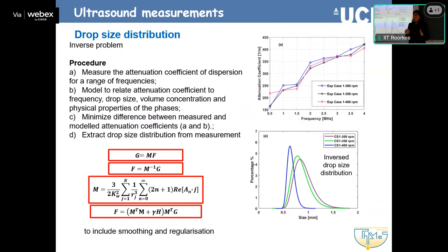With all techniques, we have to have these things in mind. Even with imaging, we can't capture absolutely everything. The resolution of your camera will tell you the smallest particle, or drop size, you can detect. Every technique has its own pros and cons. It's worth thinking about before you start. Even imaging is not the absolute truth. You have to think about what you're measuring and how you measure it.